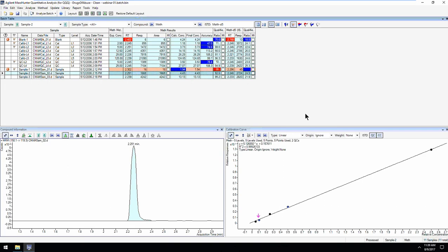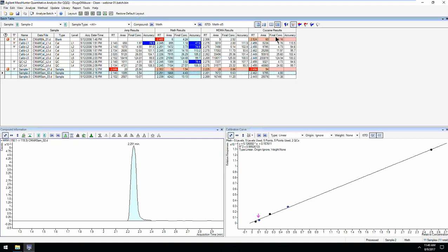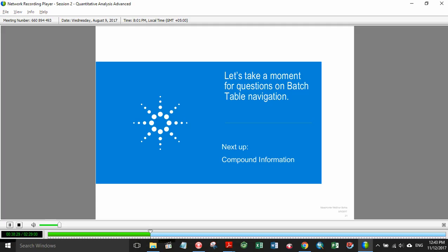Howard, did you have any other items to share? No, I was just showing that, as Steve mentioned, the response and the area typically are going to be the same once you have that view up. In that other table, the response wasn't a column, but yeah, we can fully answer that offline. Absolutely. Yeah.